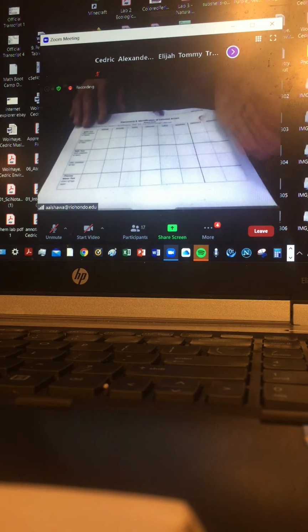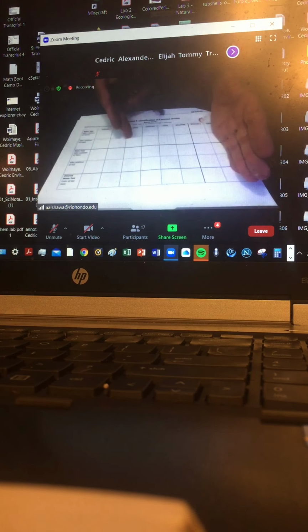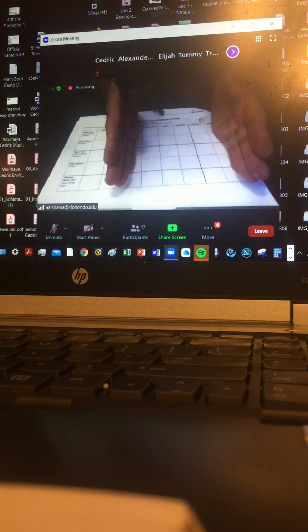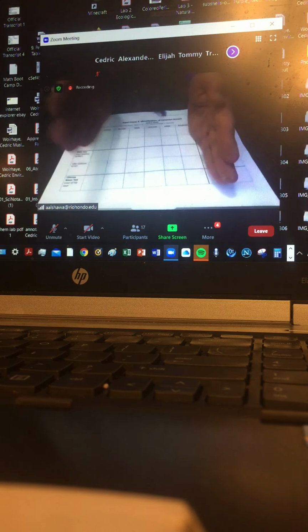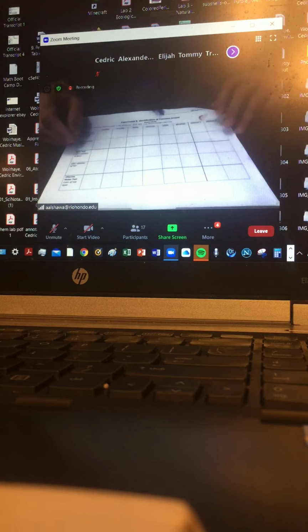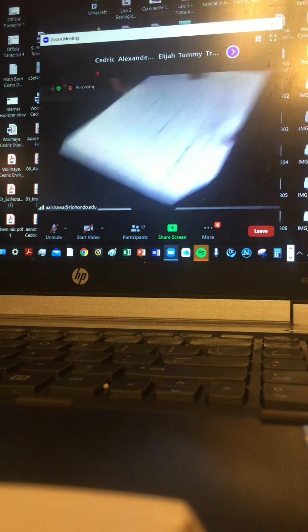Okay, so if the last column for unknown 2 matches, let's say, maybe the 3rd or 4th, it means you have that polyatomic ion or monatomic ion. Make sense? So that column should fit exactly what you see around those 6 columns. And that's how you identify the unknown.